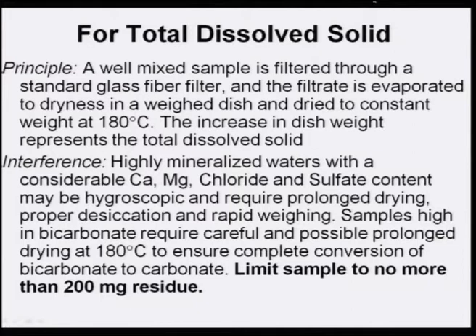to be rejected. For total dissolved solids, the principle again is that a well mixed sample is filtered through a standard glass fiber filter and the filtrate is evaporated to dryness in a weighed dish and dried to constant weight at 180 degrees. The increase in dish weight represents the total dissolved solids.